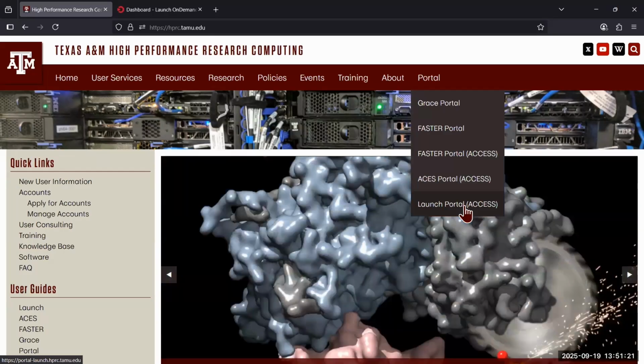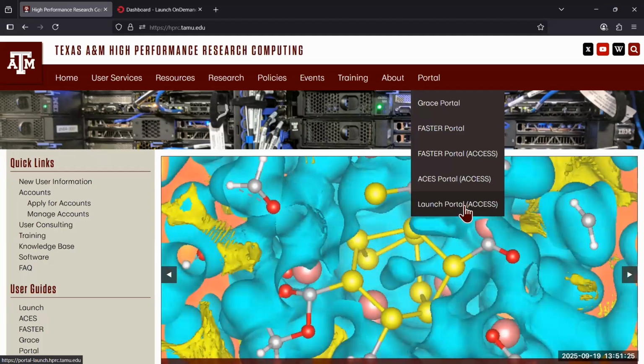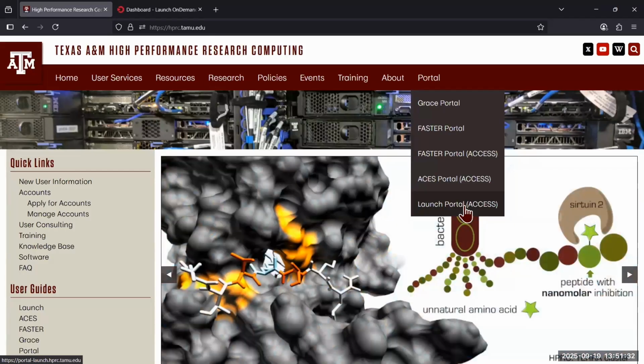Andrew, you can post this. See if they fix it. Failed to launch, failed to map, malloc. Okay, go back to look for launching.